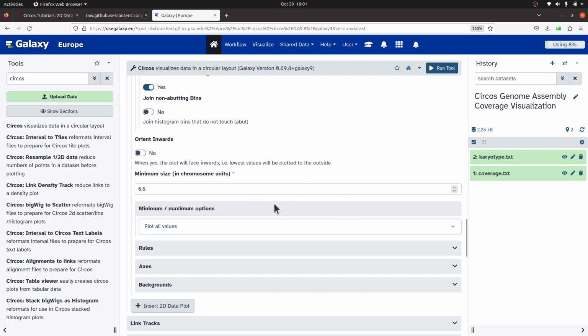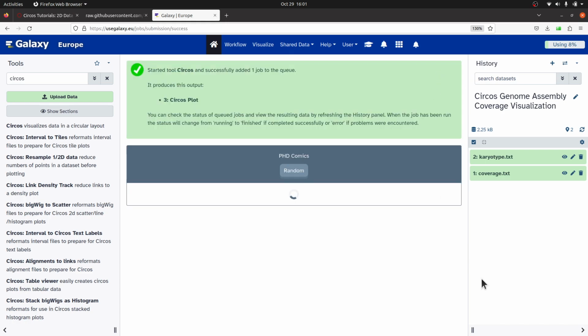Please note that you can still do some further processing, but we will do that later on. That's for advanced users. For now, I'm dealing with beginners, so I'm doing a basic plot. But there are things you can also do, such as changing colors, adding rules and stuff. But that's for another day. All right. So for now, let's click on run, and then wait for the plots to be generated for us.